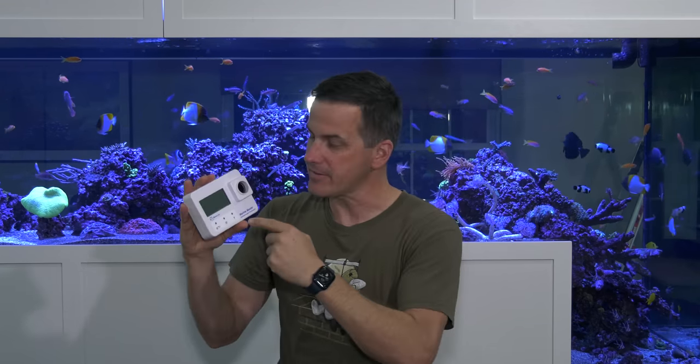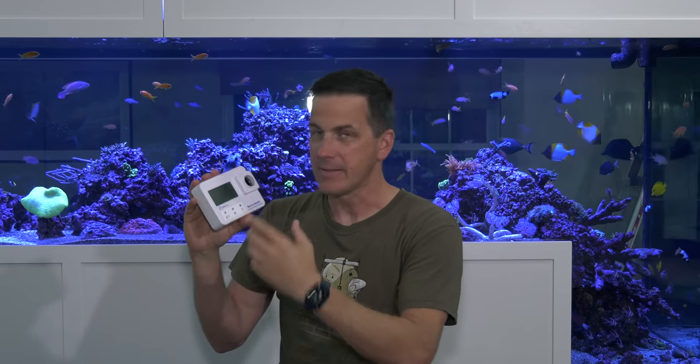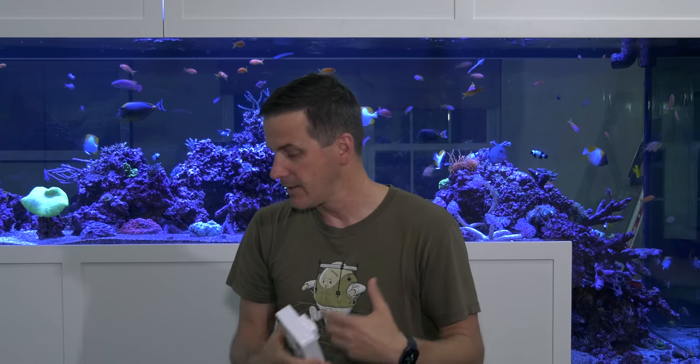This thing does all the available Hanna checker tests in one unit. I'm not going to run through every single type of test because if you're familiar with using the calcium checker, it does that in the same steps. What I want to do is see how easy the user interface is just grabbing it out of the box. I'm going to run the pH test because I don't have the pH checker and I'm unfamiliar with it. I'm going to change the camera angle so you get a close-up look at the screen.